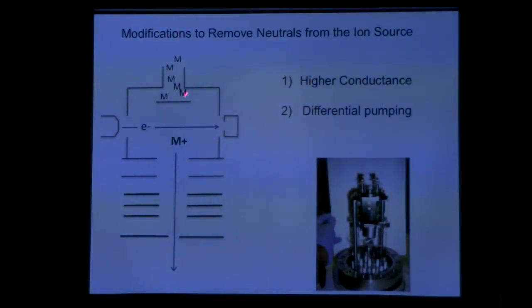In the ion source, you have neutral molecules. They come in, and then they get smacked upside the head by a high-energy electron.